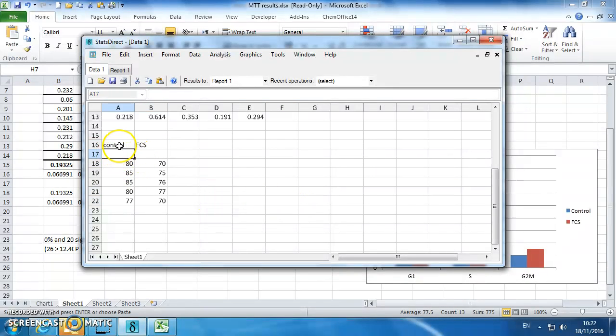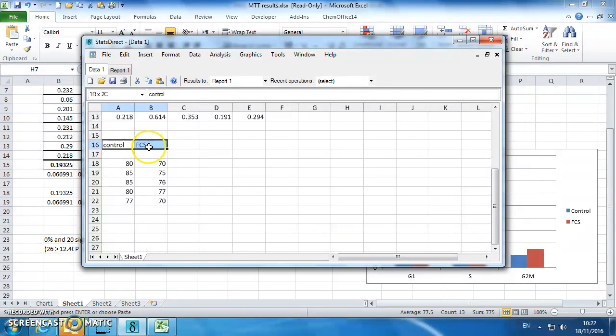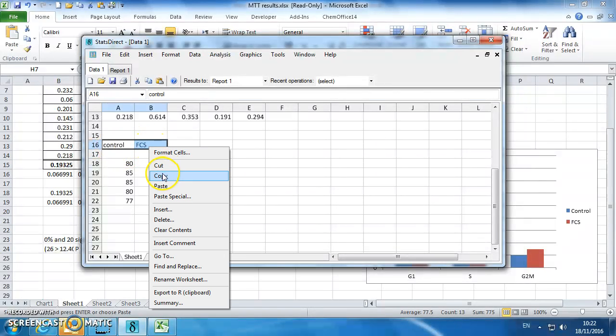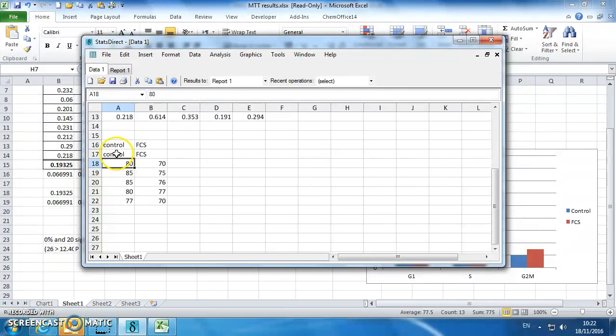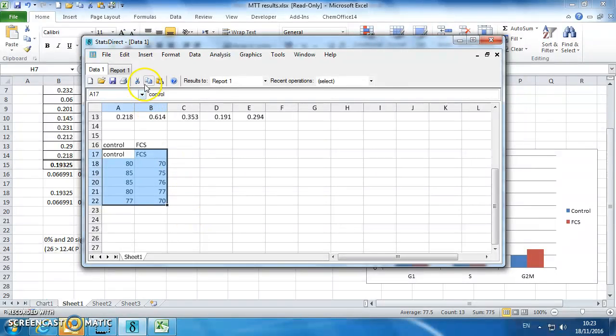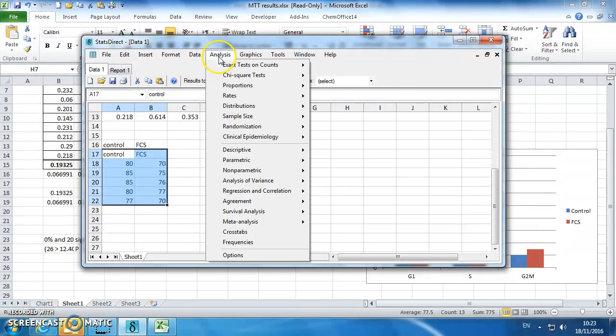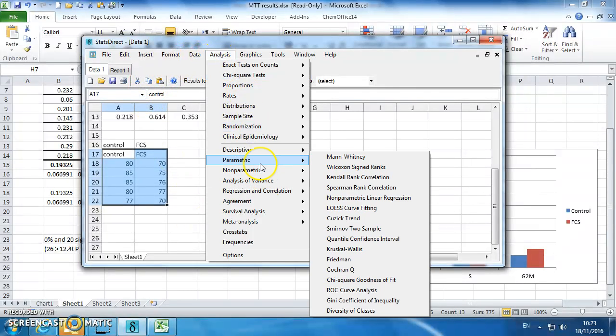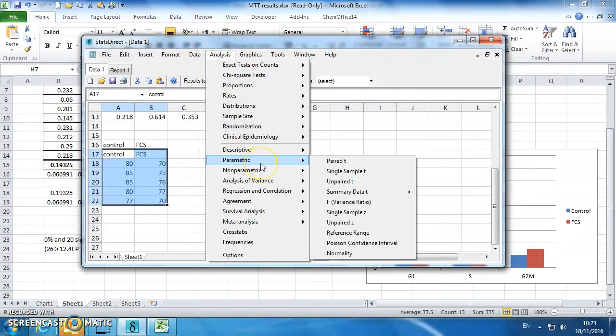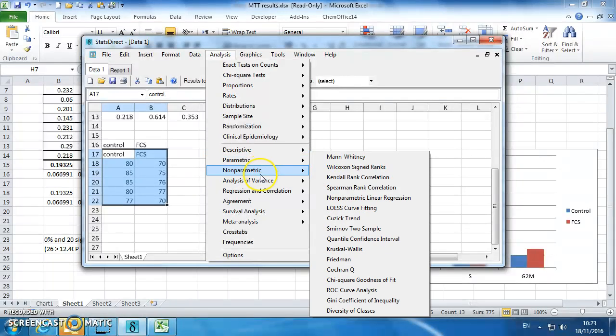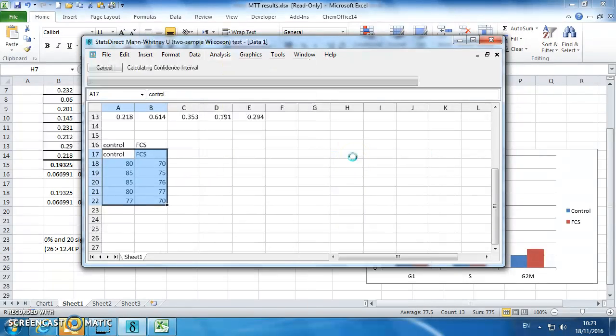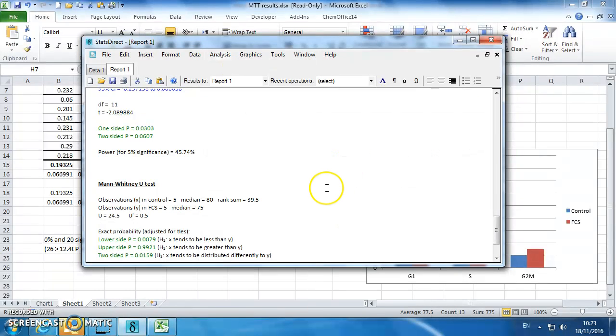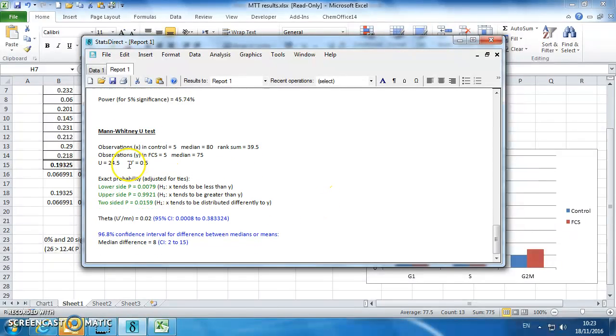We'll copy that into StatsDirect. Just highlight those two wells. Analysis, Non-parametric, Man-Whitney. Man-Whitney is like a non-parametric version of a T test. Click on that, and it will give us some data.